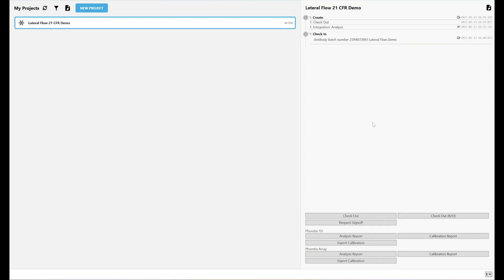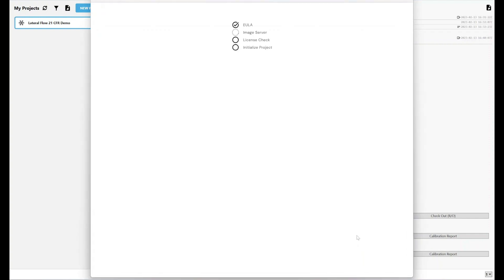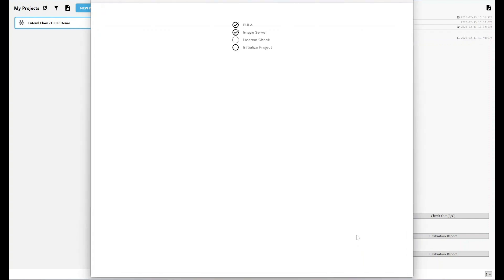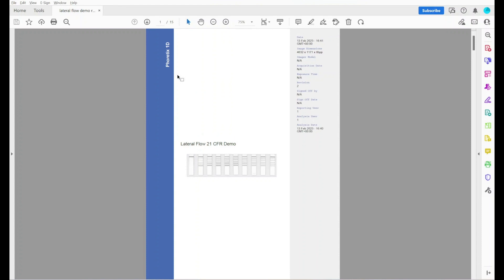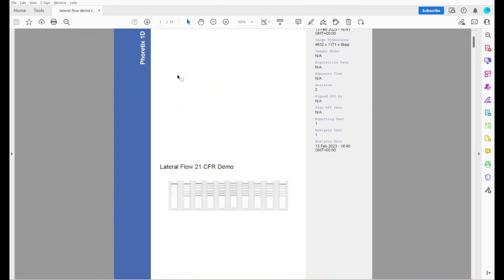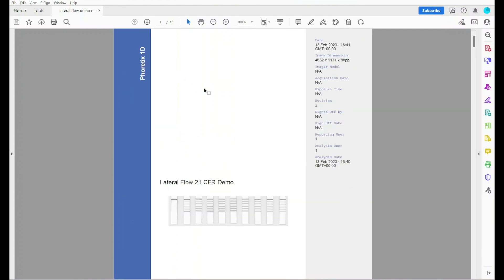Now I've done my analysis, from my GXP solution, my 21 CFR compliance solution, I can export my analysis report. If I just click here, there's no need to check out. Now the PDF report has been exported, this is what it looks like.